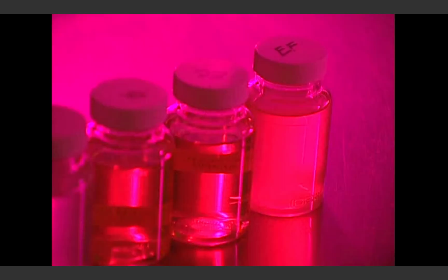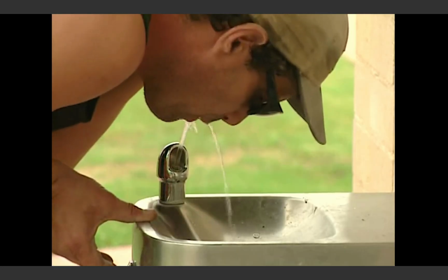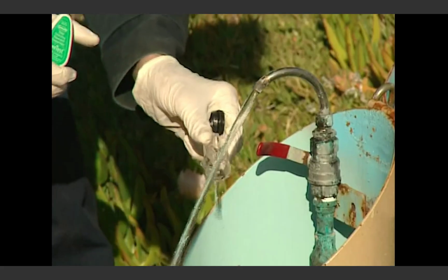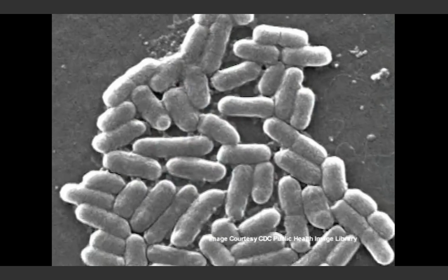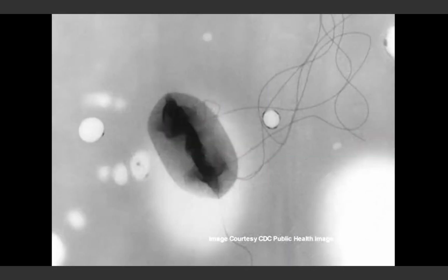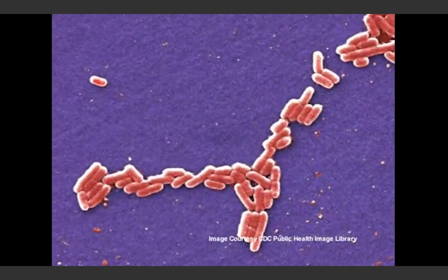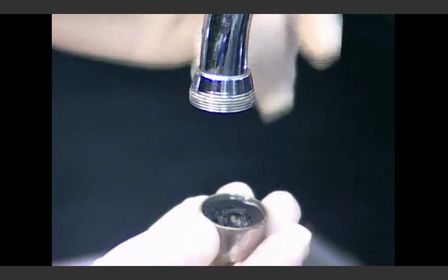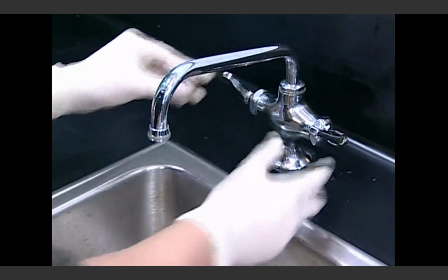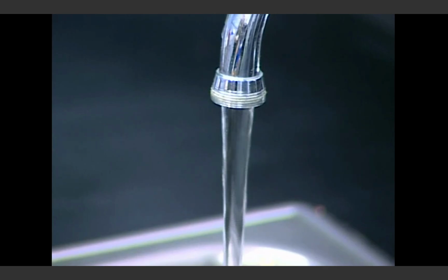Water utility staff continuously monitor water quality by sampling and analyzing drinking water throughout the distribution system. Water suppliers regularly test for many contaminants, whether chemical, biological, or physical. Microbiological contamination is monitored by routinely testing for coliform bacteria, an indicator of contamination. Good monitoring data depends on getting good representative water samples. Representative, reliable sampling and well-managed monitoring are essential to providing safe drinking water.